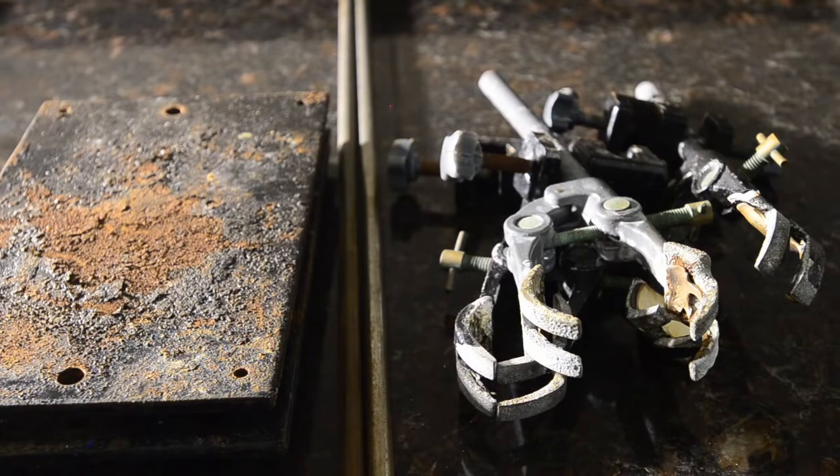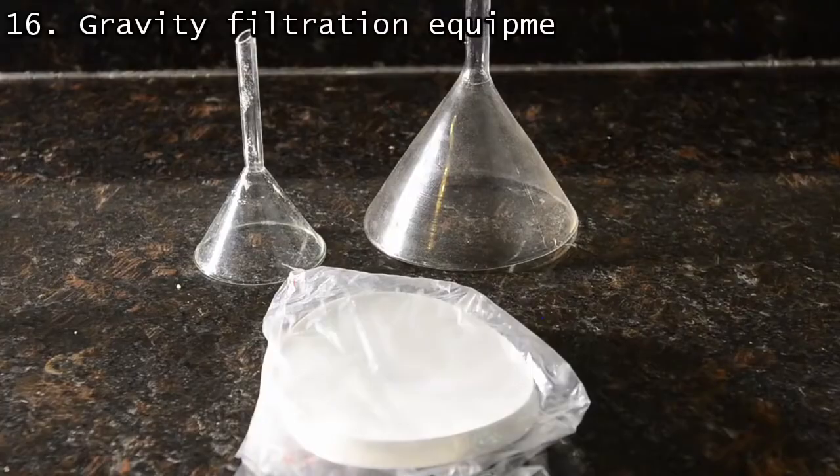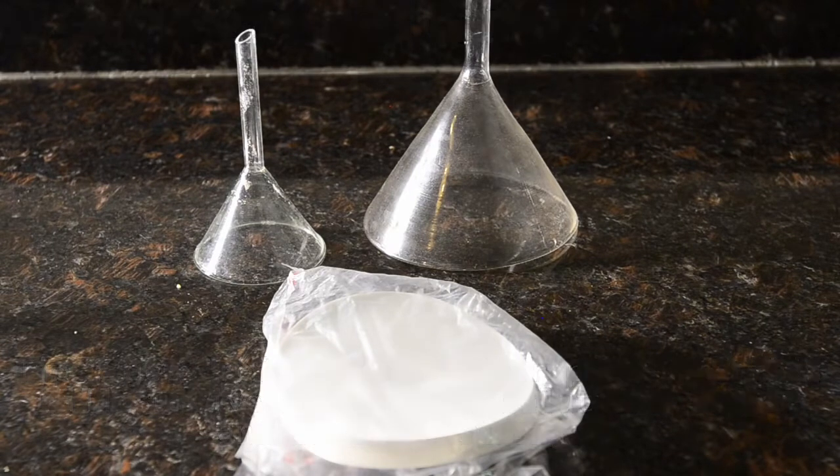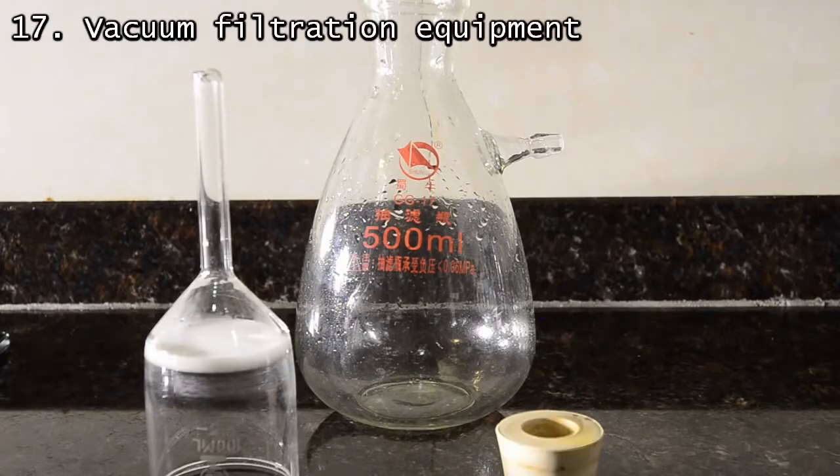You're going to be doing a lot of filtering — filtering will be your life. So you need at the very least a glass funnel and some good quality filter papers, preferably reinforced. Beyond this, you will need a vacuum filtration system.